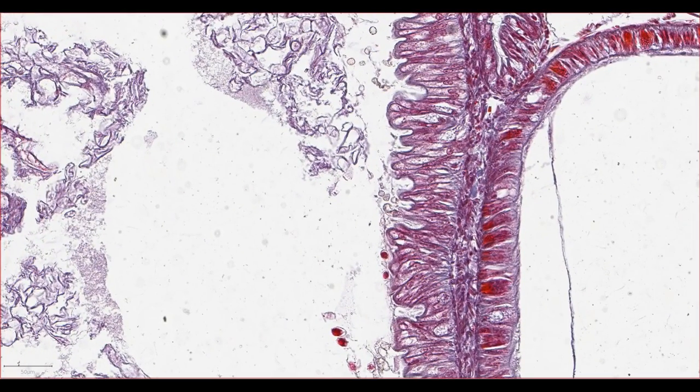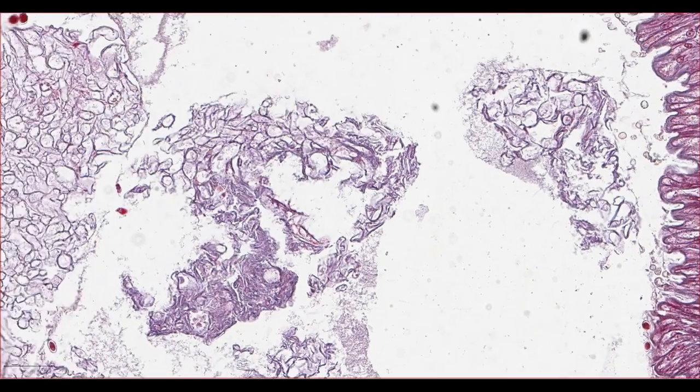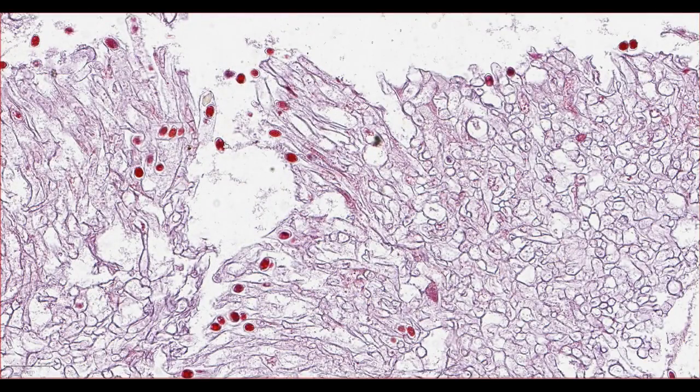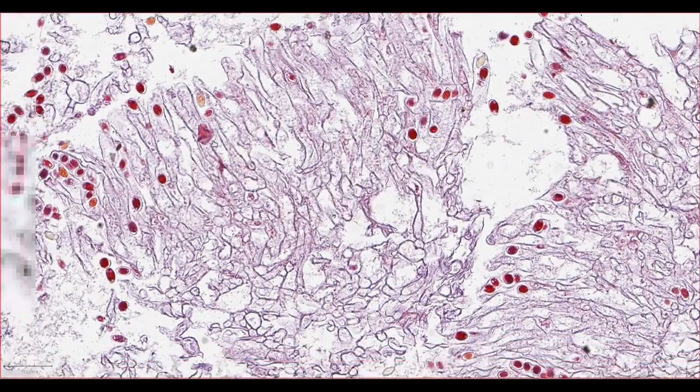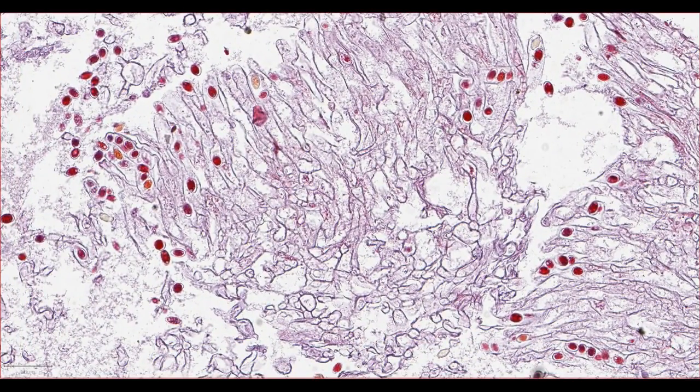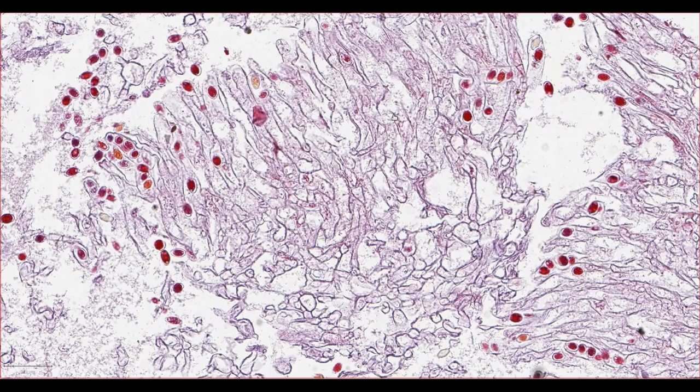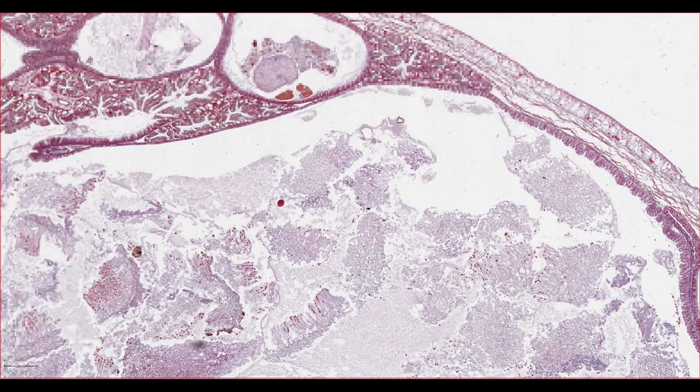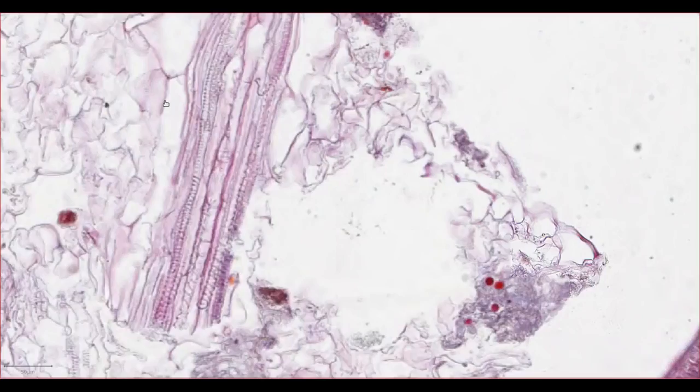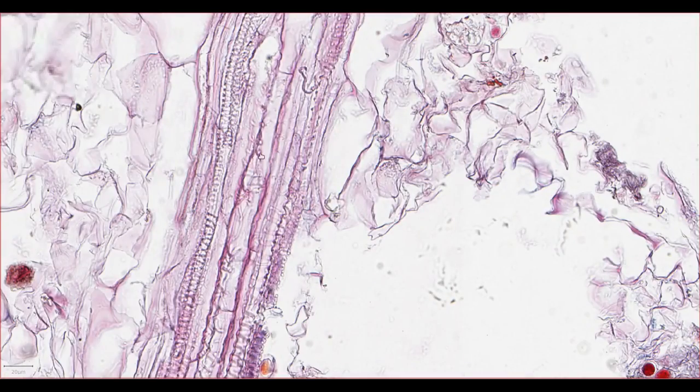While we're here, we can also have a quick look at what the snail was eating. As you can see, there are large rafts of yeasts with spores. I think these darker red structures are the spores. And then all of these branching, empty structures are pseudo-hyphae. If we have another little scan around, there's probably some more typical plant material, such as this here.